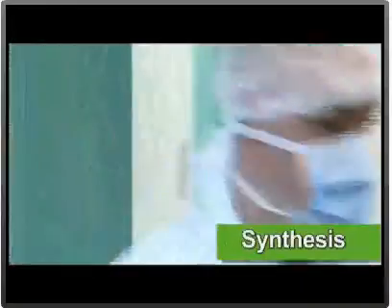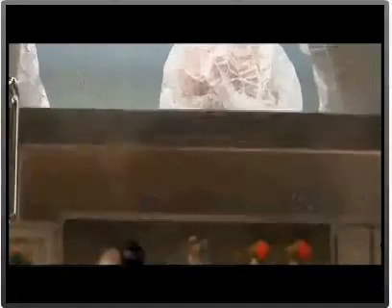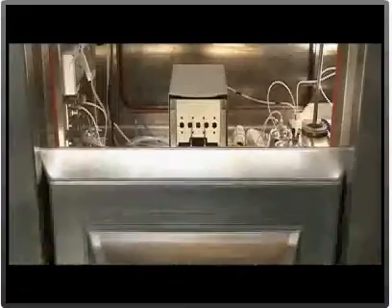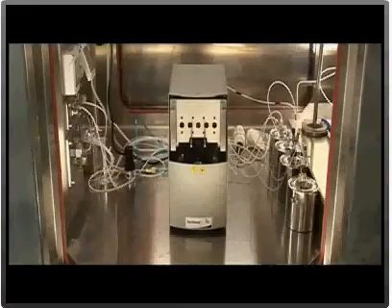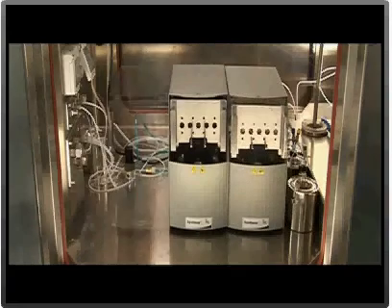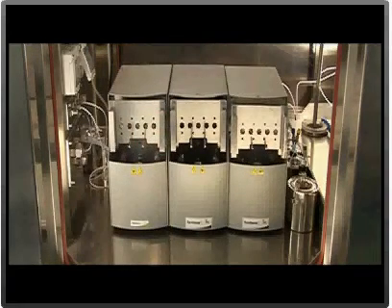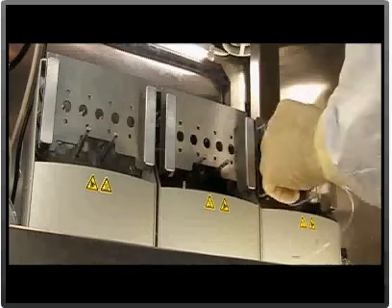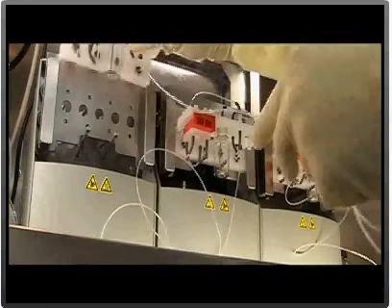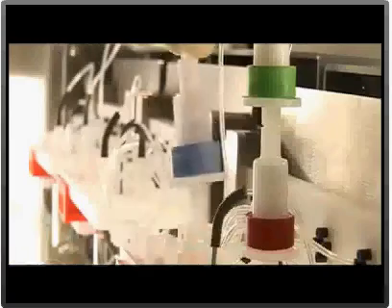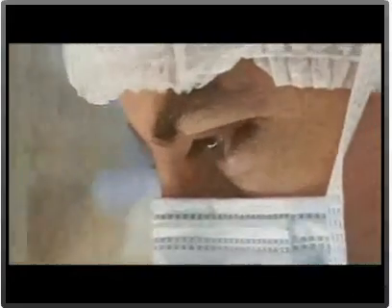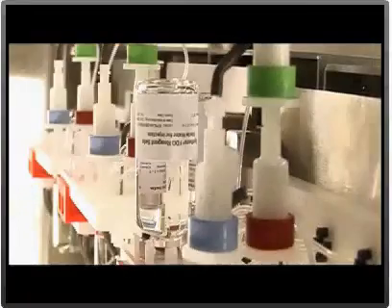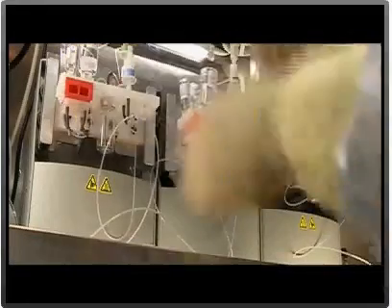The synthesis is performed by fully automated chemistry modules, or Synthera. The main benefit of the Synthera is its compactness. Multiple modules are usually needed to accommodate the increasing FDG demand and production reliability. Whereas traditional modules require extra hot cells and space, the IBA modules allow our site to operate up to 3 of them in a single cell, therefore allowing superior backup capabilities.